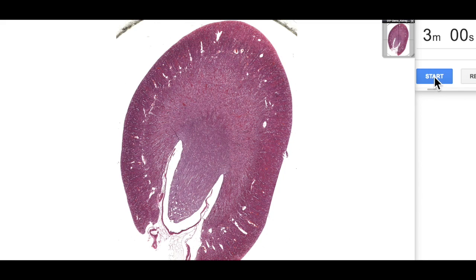So let's start off 3 minutes. So as I just mentioned, out here we've got the renal medulla which ends in the renal papilla, which is that projection here which is drained by the minor calix.